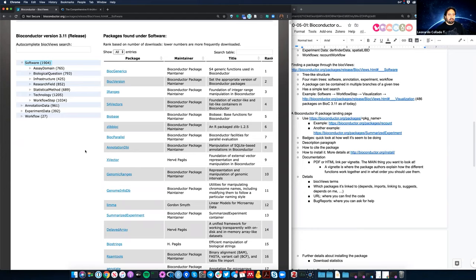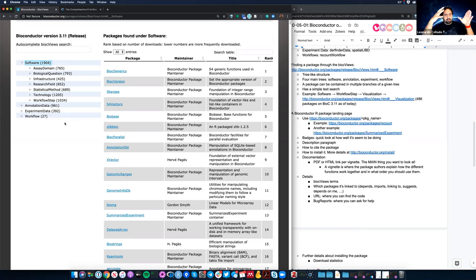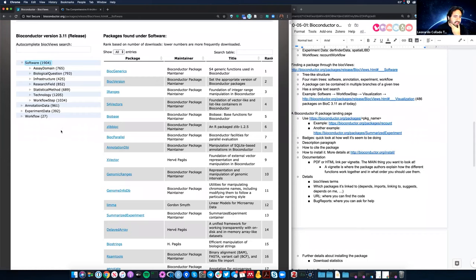BiocViews is really like four different trees: one for software, one for annotation data, one for experiment data, and one for workflow. Each tree has different branches, and you can get into smaller and smaller branches. The package author can label their package with as many of those branches as they want, even across different major branches. The idea is to make it easier for people to find what they might need.